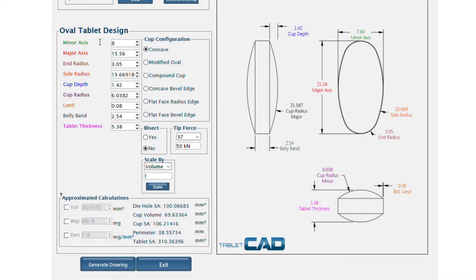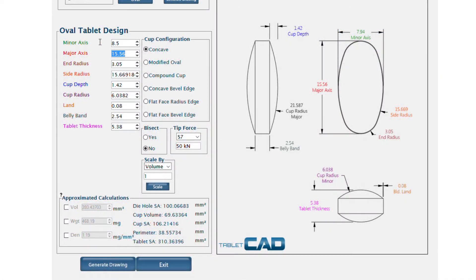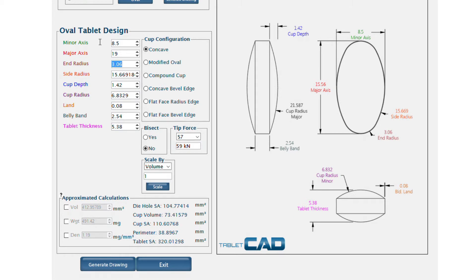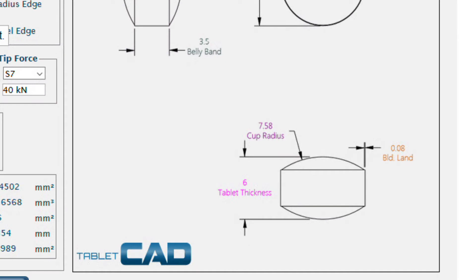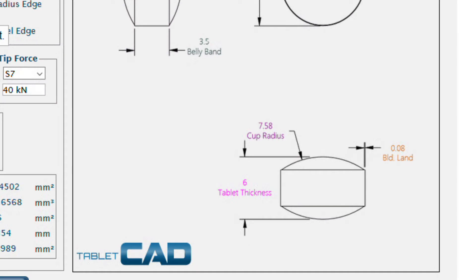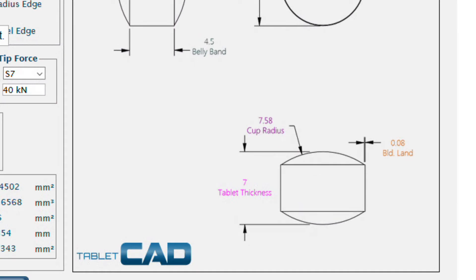With Tablet CAD, you can compare and contrast multiple tablet designs very quickly and easily. Tablet CAD provides real-time validation of all tablet parameters and dimensions, including the all-important overall thickness.